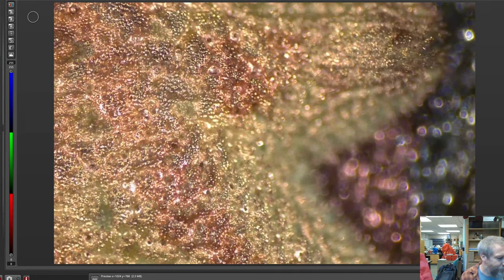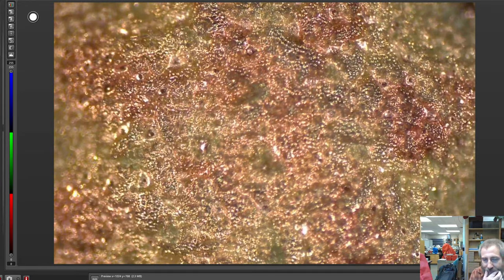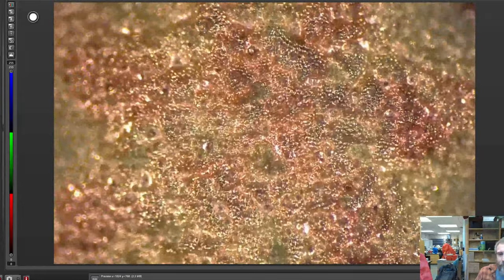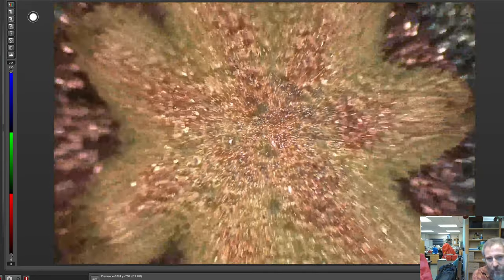But this is what it looks like to the stereo microscope. Kind of neat. We saw some of the same features, although I feel like the plates were a lot easier to see in the scanning electron microscope than they actually are in the stereo microscope, and that's partly because there's a depth of field issue going on. We can only get so much of it in focus at the same time because of the elevational differences, and that's probably the major handicap of a stereo microscope and of using light, which is basically we can't see all of it at once in focus.